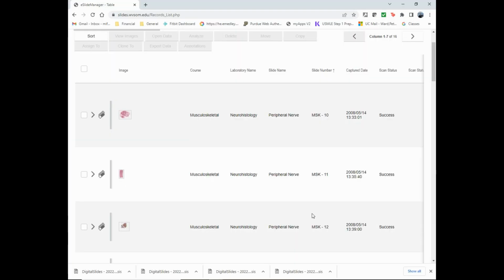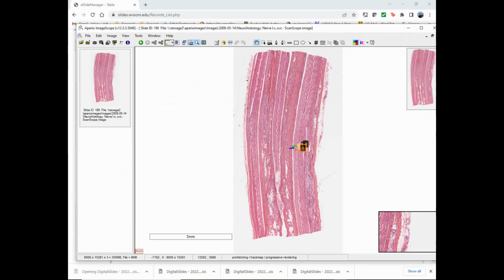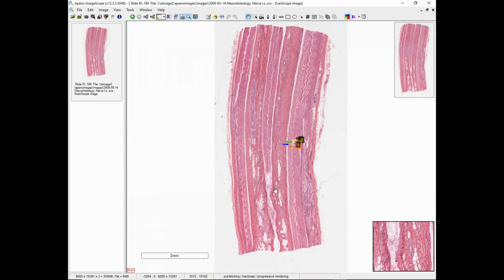We're now going to switch gears slightly and look at the peripheral nerve, not in cross-section, but in a longitudinal section. And this longitudinal section, basically, if we were to qualitatively describe it, looks like a bunch of wavy lines. But what's cool about this is that these wavy lines, even though they look similar, are going to be showing us connective tissue and nervous structures of this peripheral nerve in its longitudinal state.